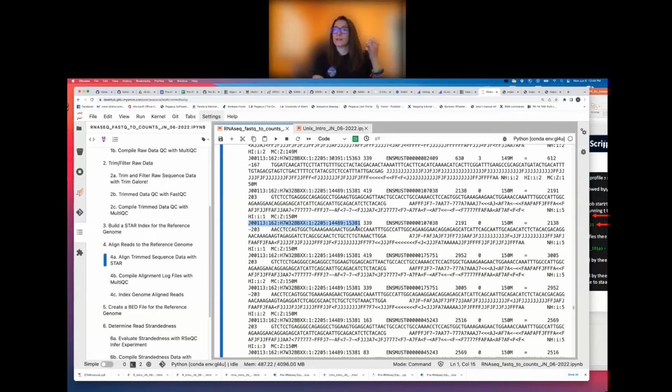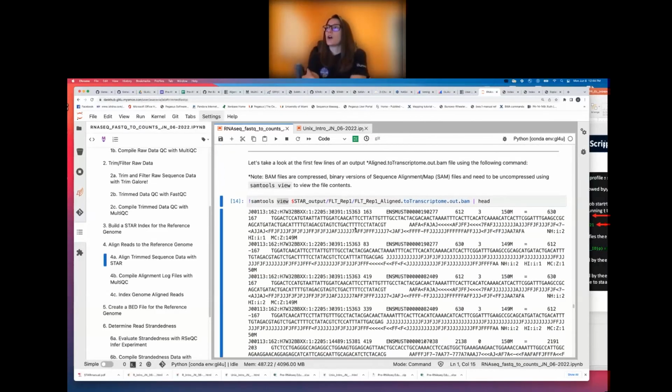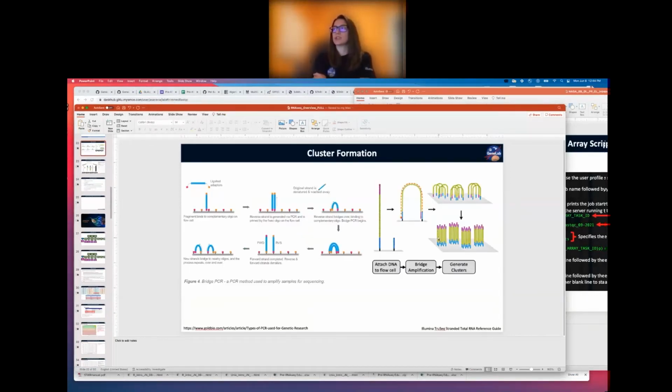So Amanda, I'm a little confused as to how there's only 2 read pairs. Okay. So are you understanding the information that's provided in the read header here? Yes. Okay, so this is essentially an address that's going to correspond to the cluster location that we're sequencing, right? So to this location here. So that means that address is going to be the same for both the forward and the reverse read acting on that template in that cluster. You follow that? Yes.